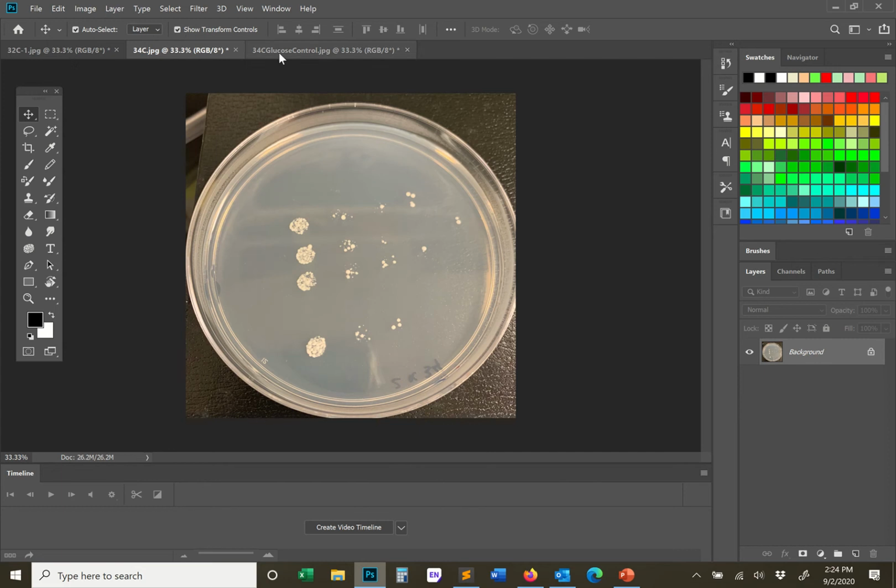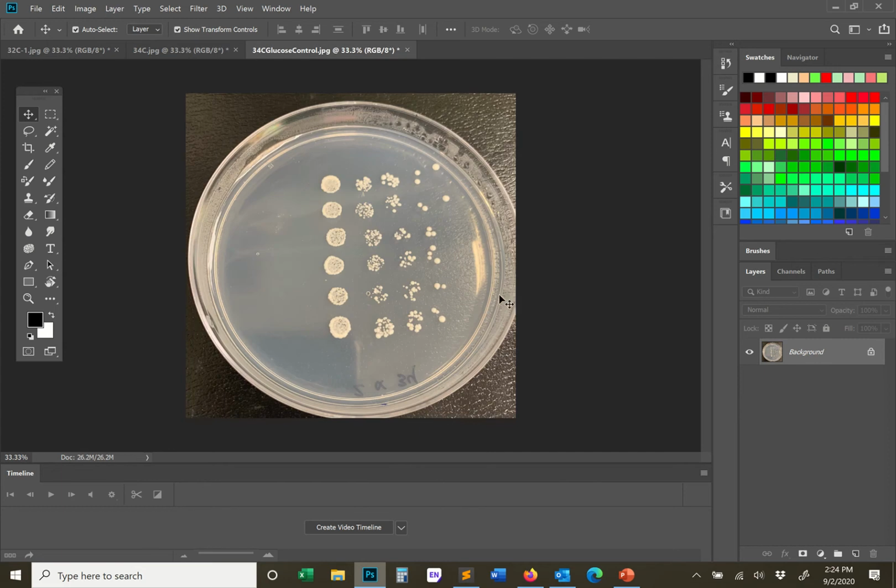These images of this data are not ideal. There's glare, so that means there was a light source. There's sort of an imperfect background, so the plates are sitting on top of whatever this material is here, and this material is coming through here. All these things can confuse the viewer and make the data harder to interpret.